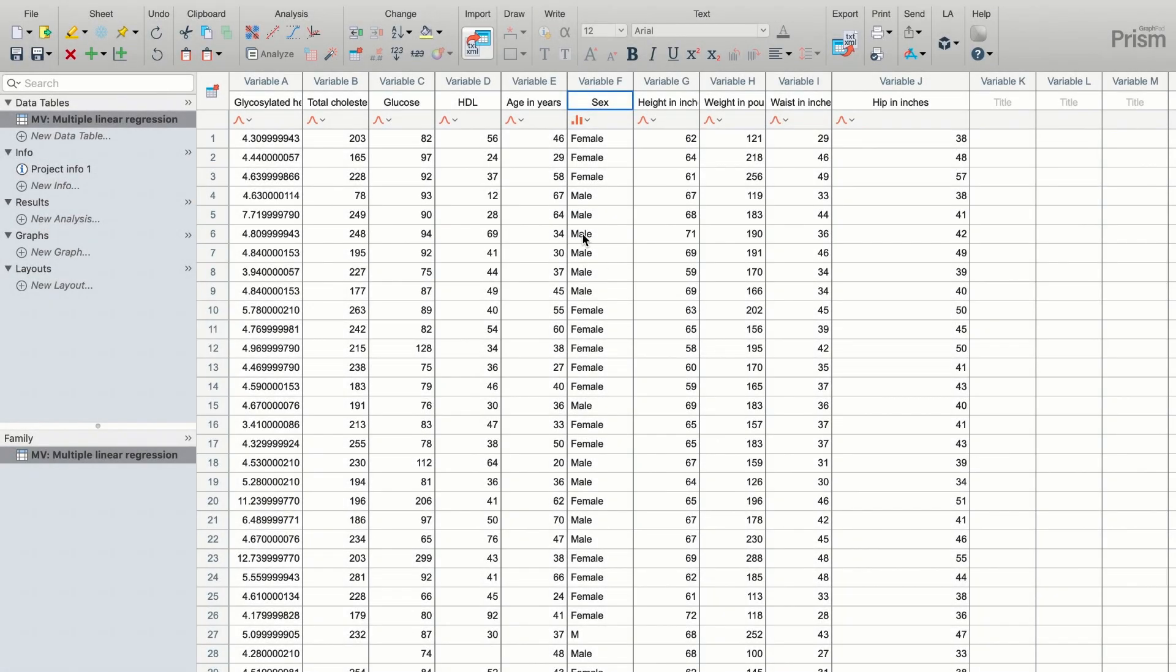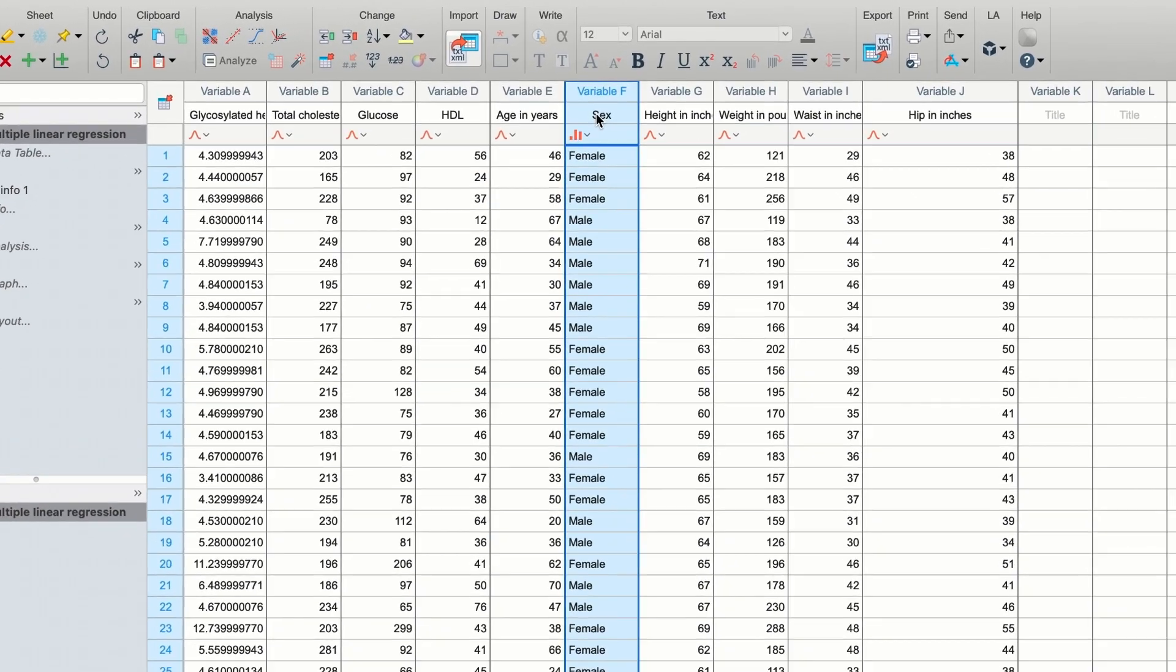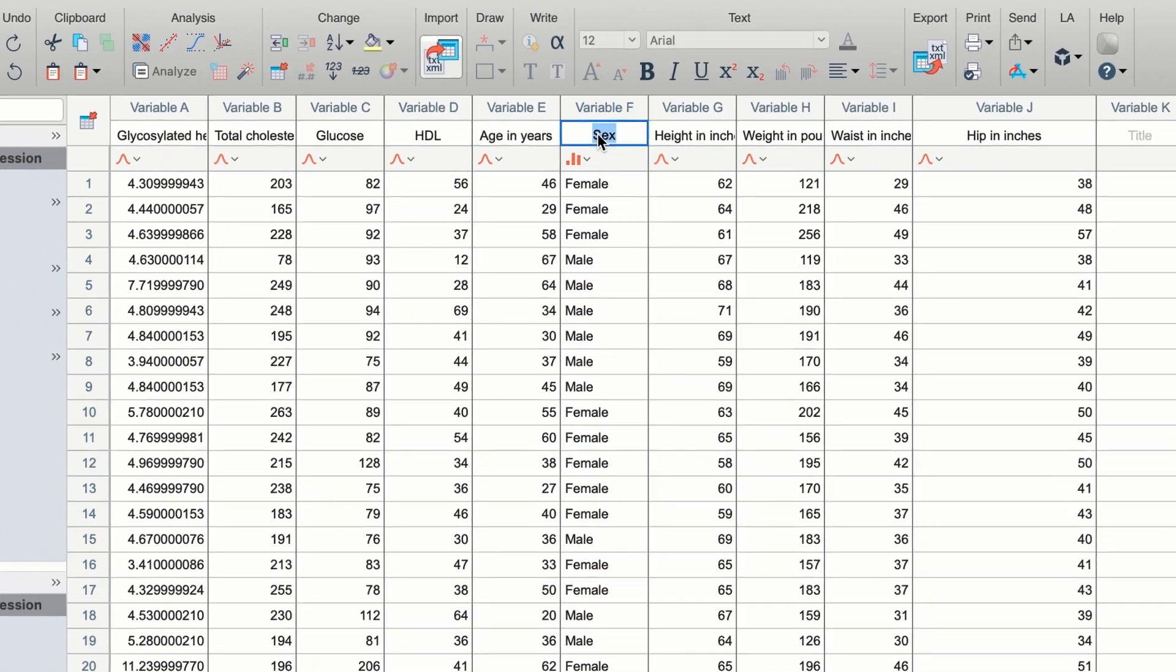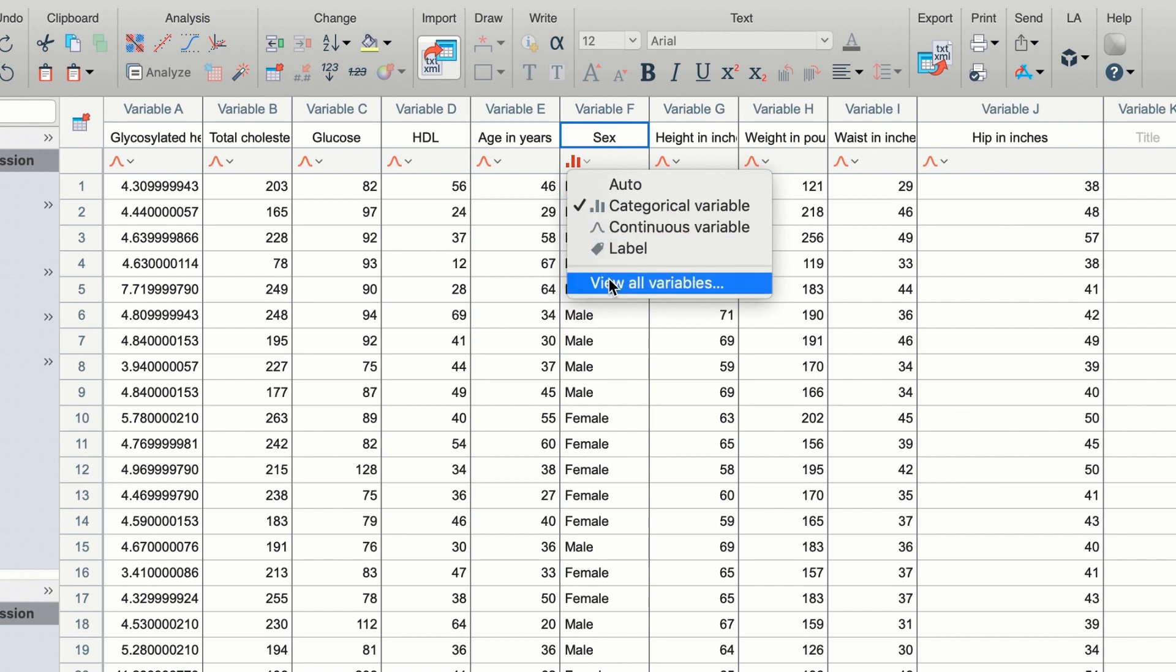Let's start with the multiple variables data table, which now allows both continuous and categorical variables. Instead of coding a text variable with zeros and ones, simply enter text, such as male and female, directly in the data table. Prism automatically identifies each variable as either continuous, categorical, or label. Just enter your data and let Prism take care of the rest.